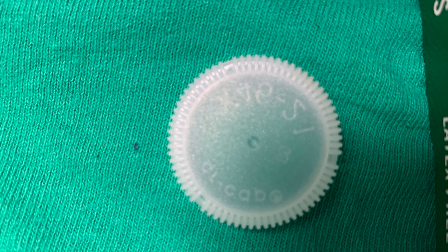Just to give you a sense of size, I will place a pin dot on my shirt. Here is the dot next to a water bottle cap for reference.